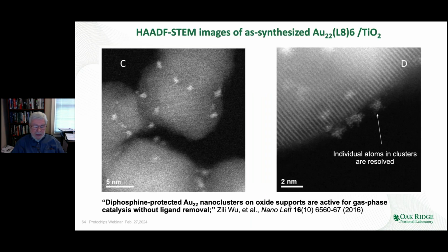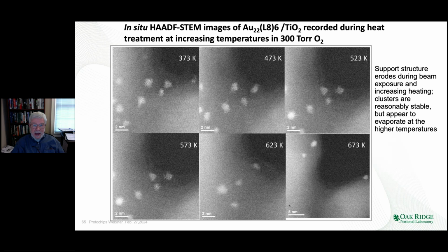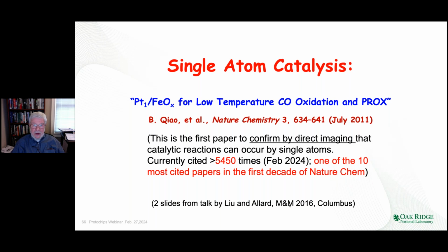I had an example here of nanoclusters, imaging nanocluster movements and gold nanoclusters on titania. But I want to just finish with this example of doing single atom catalysis. Can we do single atom imaging in the gas cell?